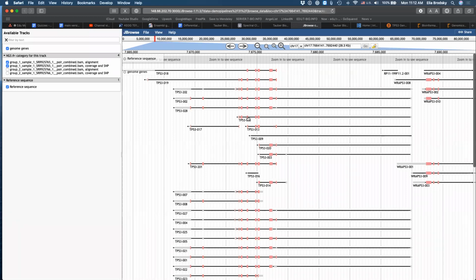Okay, what do we see here? Let's just briefly review the interface. This is JBrowse. JBrowse is an open source visualization of the genome. What do we see here? First of all, you can see right here are the nucleotides. It goes from 0 to about 80 million. Right here, the next line shows you that we're actually looking at this little tiny area from this range.